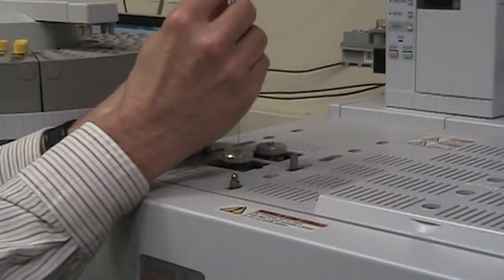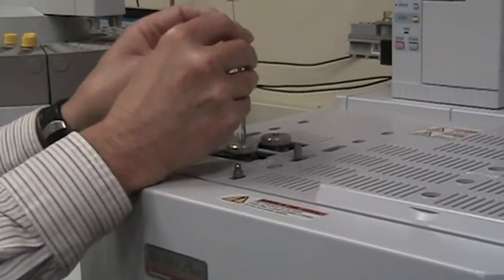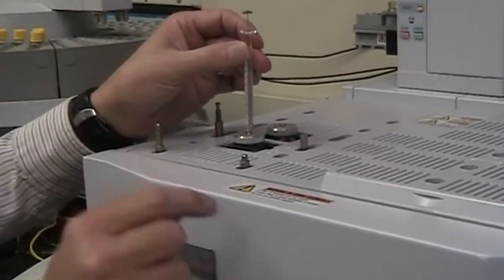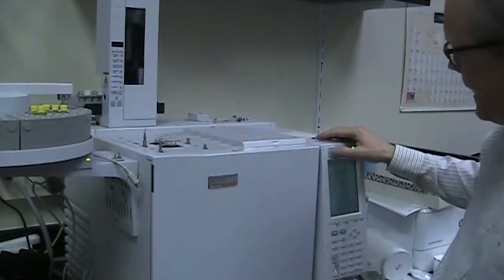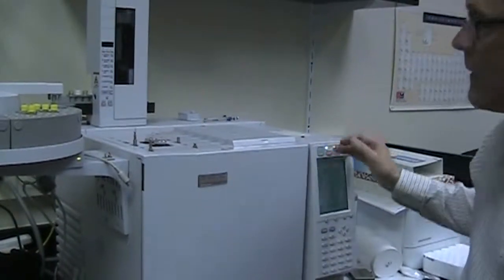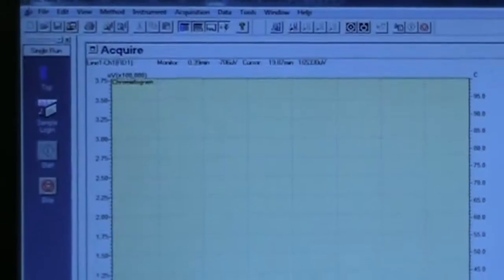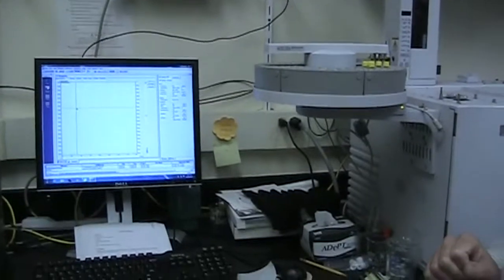And then I'm going to do two things in relatively quick succession. I'm going to push this to inject the sample, and then I'll press the start button on the front of the instrument. So all the way down in the injection port, inject, and start. When you do that, this will start flashing, and instead of ready standby, it now says acquire. It's actually collecting the data from the sample you just injected.